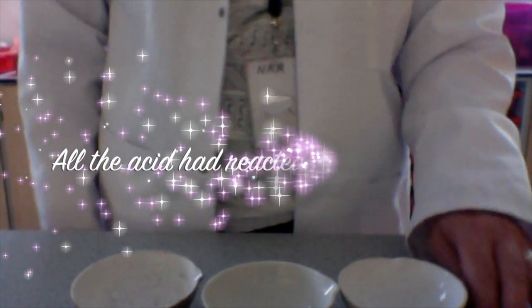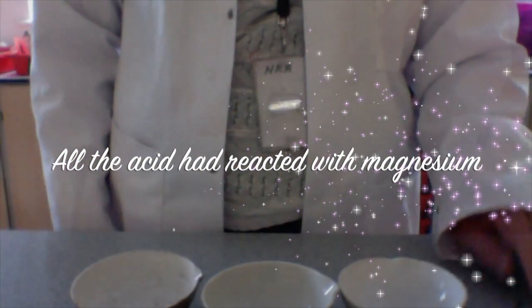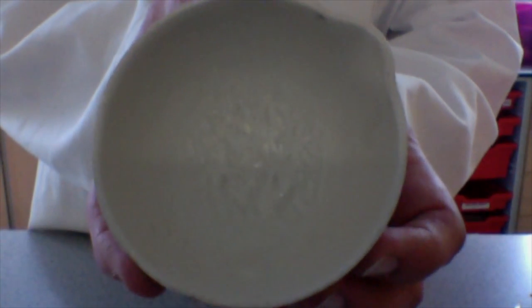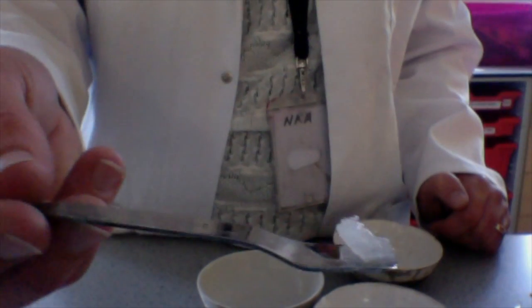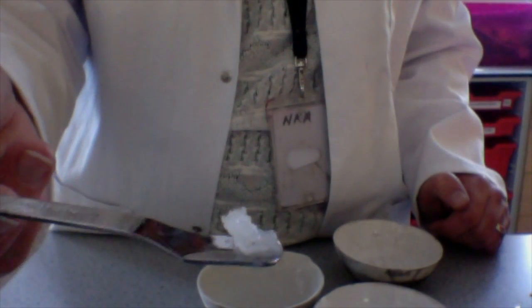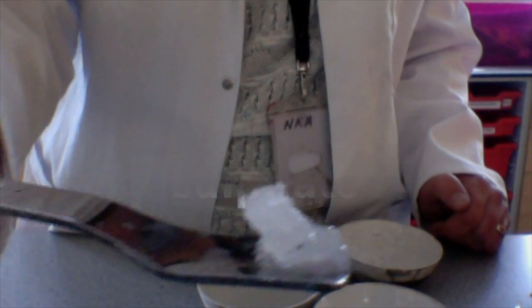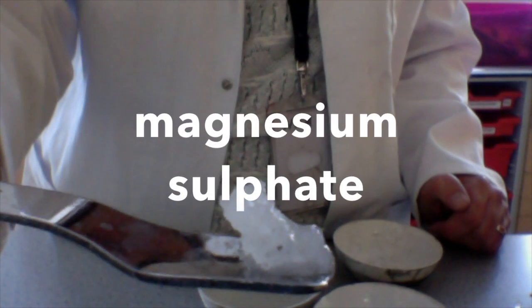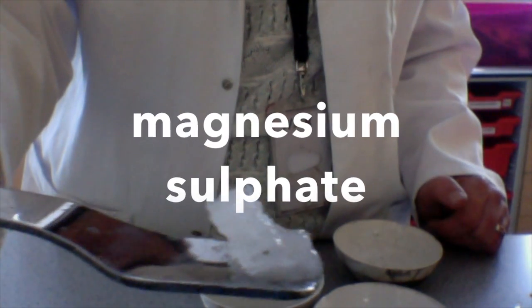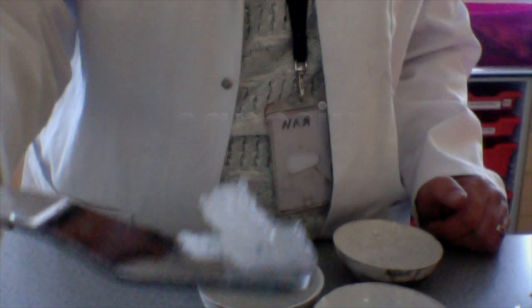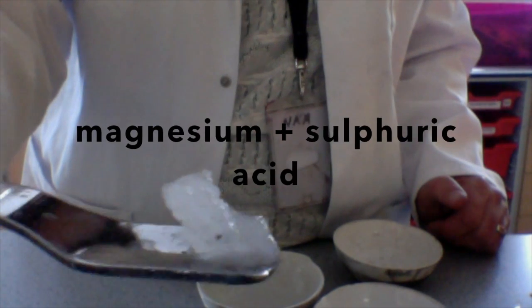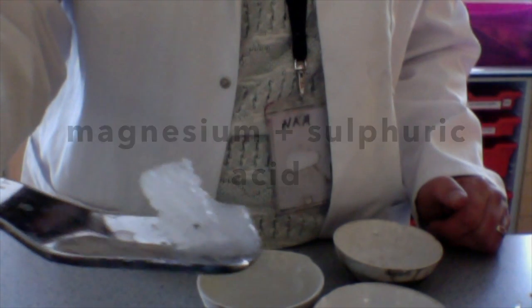Instead, luckily here another group made one earlier. Hopefully you can see that we've got crystals in here. So we can actually take these crystals out of the evaporating basin. Crystals of magnesium sulphate. We reacted magnesium with sulphuric acid and made magnesium sulphate.